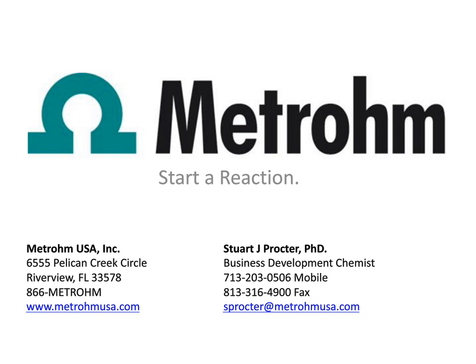I was just going to say, a lot of it, with SPE, one of the main points is solvent exchange. There are a number of different SPE techniques. Whatever your sample is in, you can do some sort of bind and elute strategy. I'm just talking very generally here on SPE. You can bind the analyte to the sorbent and then elute it with a different solvent just to do some sort of solvent exchange. So that's it.